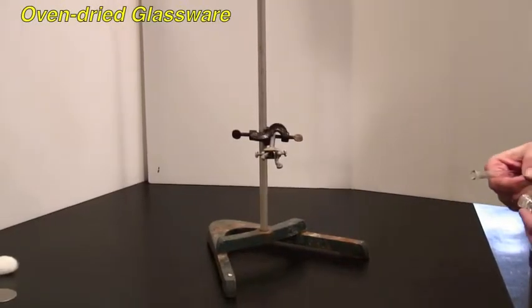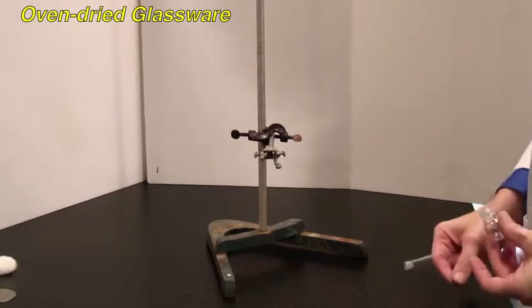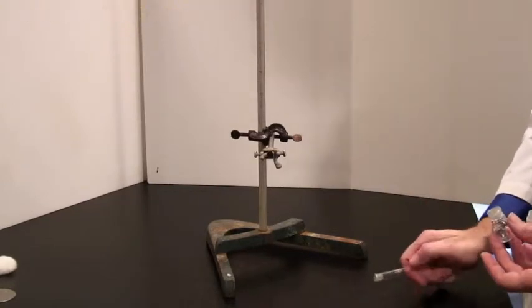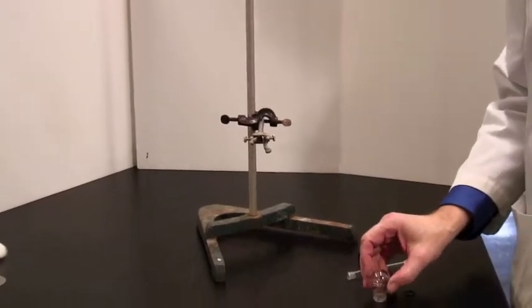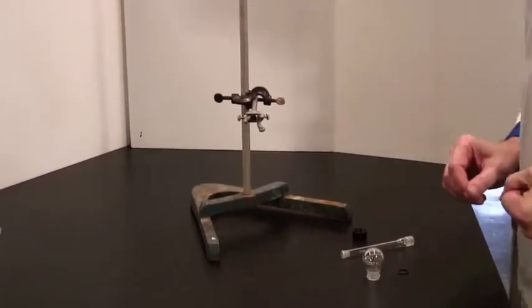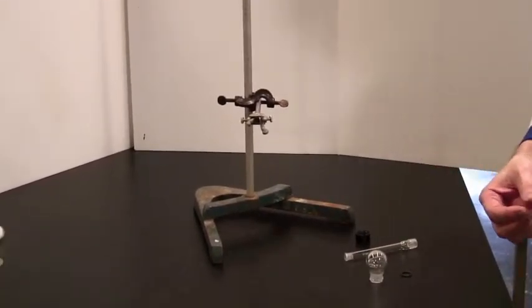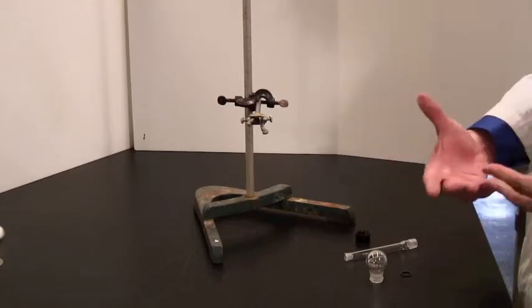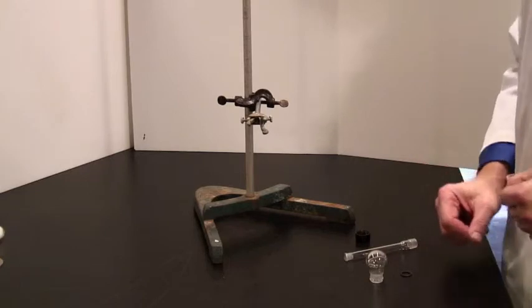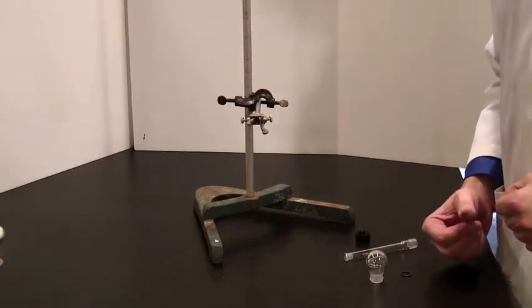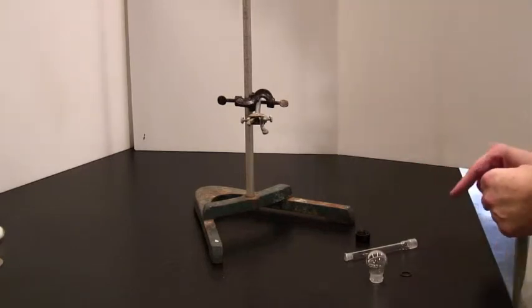Another useful thing in anhydrous technique is to actually oven dry your glassware. So you will have taken some of your glassware and popped it in the oven for a short overnight. Try and assemble the glassware while it is still warm, not burning hot, but while it is still warm, to ensure that any water that was adhering to the glass surface has been driven off by the heat.